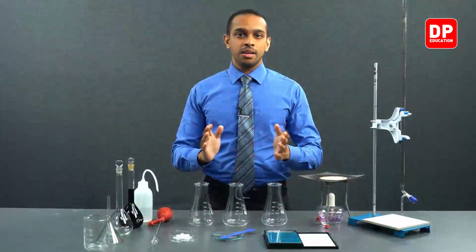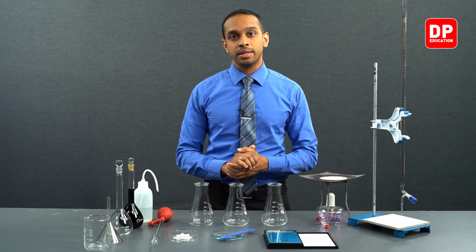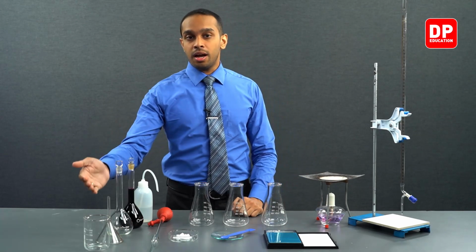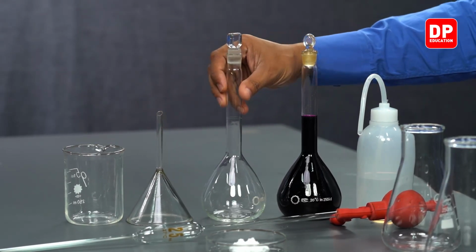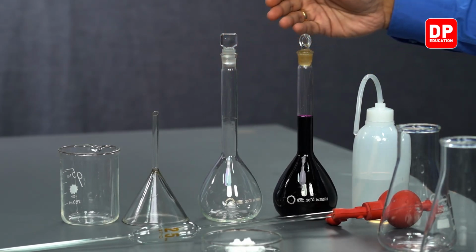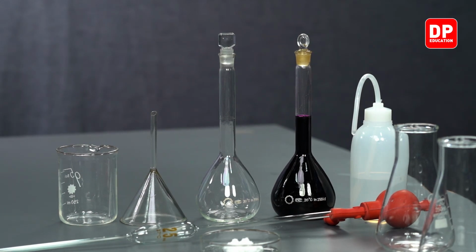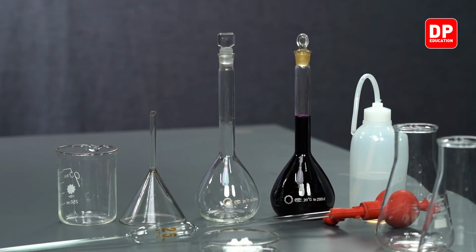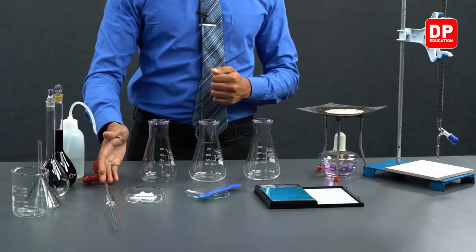Now, let's move on to the reagents we will be needing for this practical. These are the reagents and the equipment we will be using for this practical. We will be needing a beaker, a funnel, a 250 milliliter volumetric flask. We will be using a potassium permanganate solution with approximate concentration of around 0.02 moles per decimeter cubed. We will be using a wash bottle, a pipette, and a pipette filler.